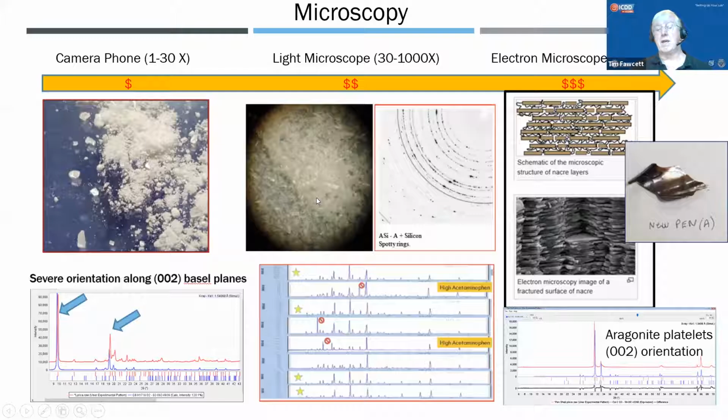Here we have another case where we used a material in a pharmaceutical round robin that had very large crystals that resulted in granularity. We told people in the round robin to grind them doing the standard sample prep, but some people still got these big grains. If you scanned along 2 theta, and here's the 0 point, so if we scan this way, you can see we get this intense, irreproducible peak in this one scan right here, and that's what you're seeing down here. So in this round robin, if we have these pictures, we can explain exactly what's going on in these X-ray patterns, that it's a granularity effect. Some people got the right results because they did a good job preparing the sample, and other people got poor results.